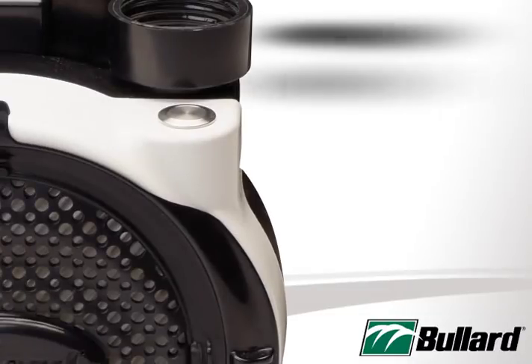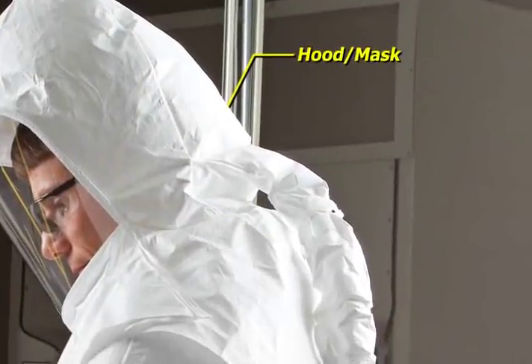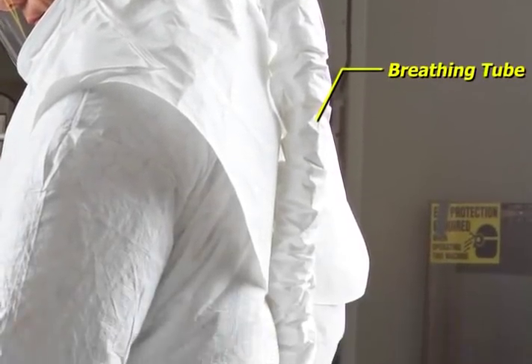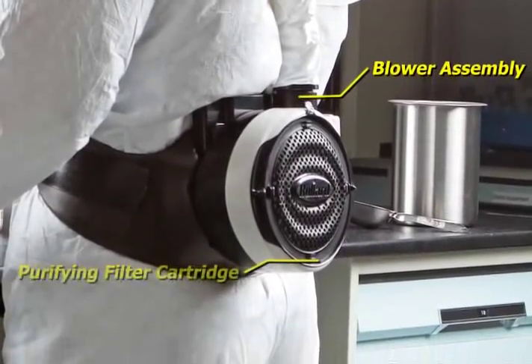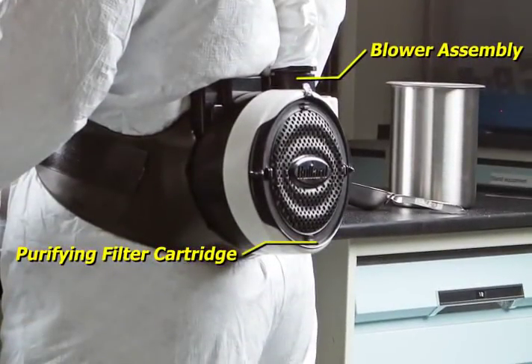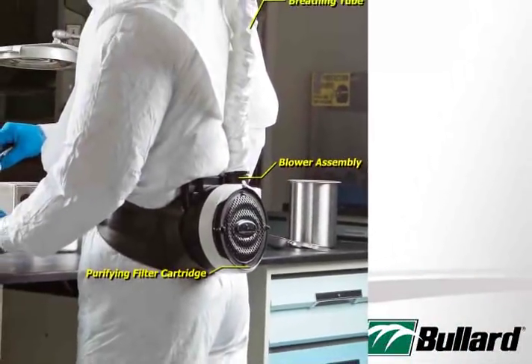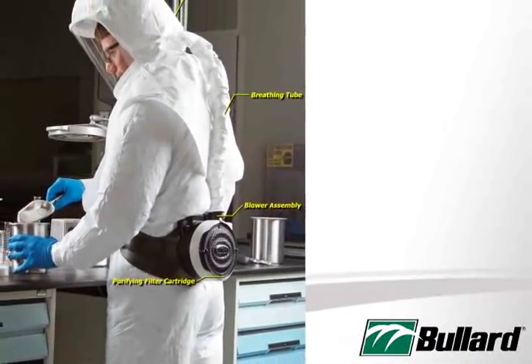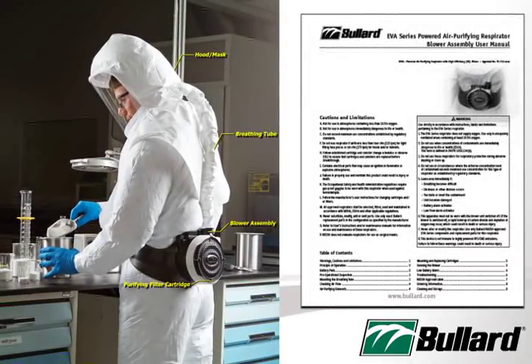A NIOSH approved EVA powered air purifying respirator system consists of four components: the hood or mask, the breathing tube, the blower assembly including belt and battery, and the purifying filter cartridge. Each of these four components must be present to maintain NIOSH approval. Consult the NIOSH approval label located in the user instruction manual for a complete list of approved components.